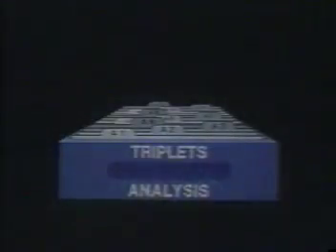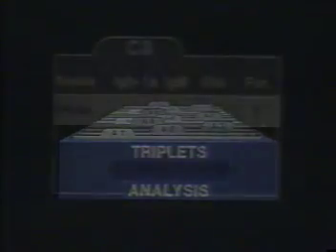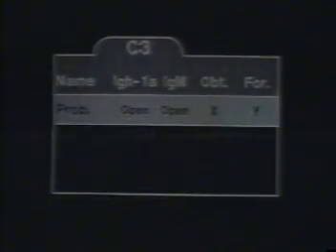For each contour map, integration value, or histogram that Tom needs, he must signal the secretary to place a request onto the appropriate card in his triplets analysis drawer. An analysis card looks something like this on Tom's terminal screen. The gray section across the top describes the sample and the parameters that were measured. On the lower portion of each analysis card, the Magic Secretary keeps a permanent list of the analyses requested for that sample. The white line on this card indicates that Tom has so far requested one analysis on this sample.